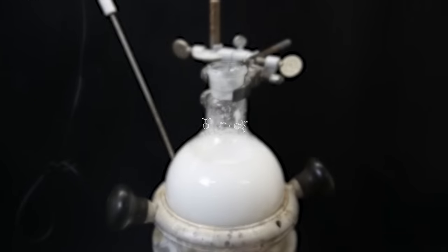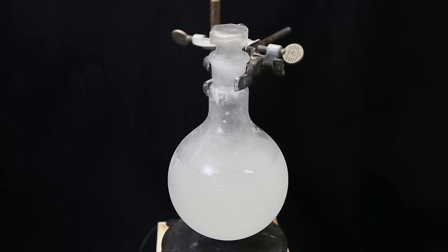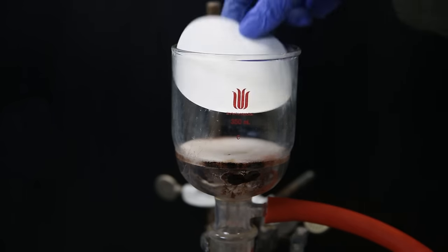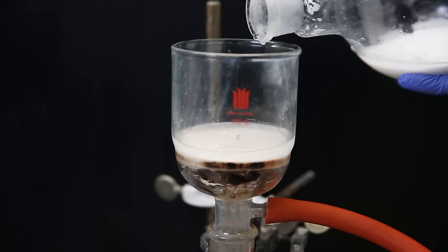When I come back, the mixture has turned more clear, and I let it cool down to room temperature, which causes a bunch of solid to precipitate out. I put the flask in the freezer for a while, and more solid has precipitated. I then filter it all through my dirty glass filter and force a paper filter on top, because unfortunately my good filter shattered on the ground.